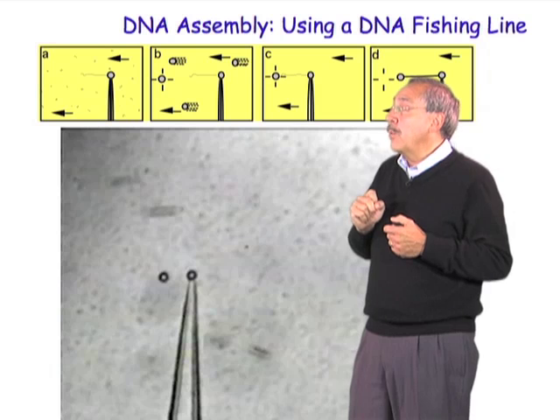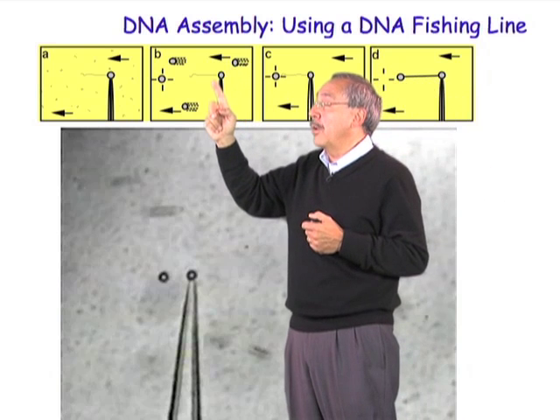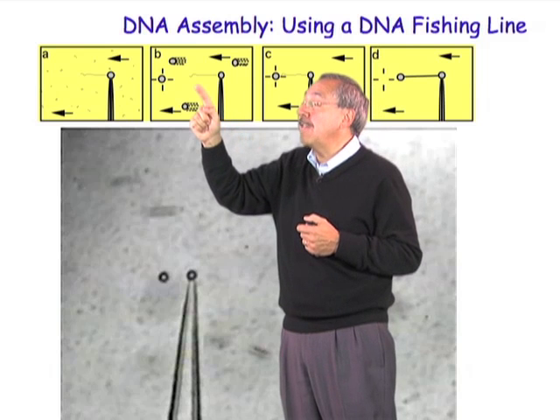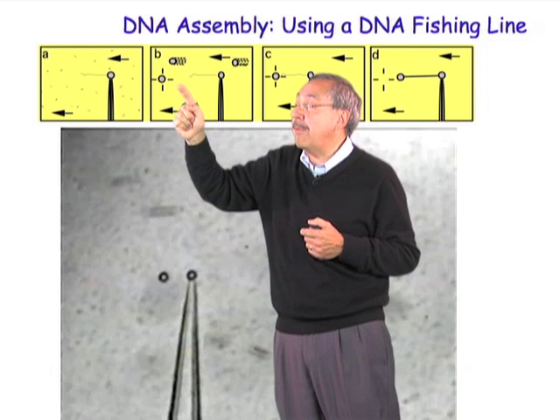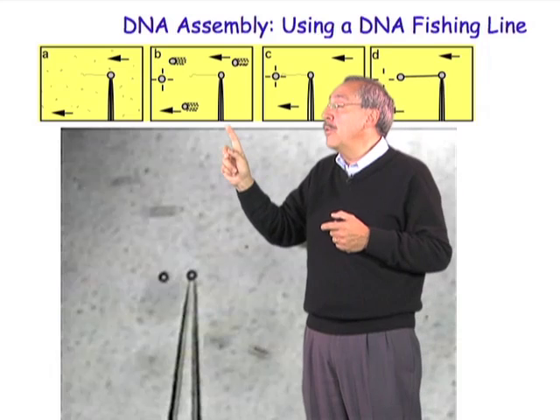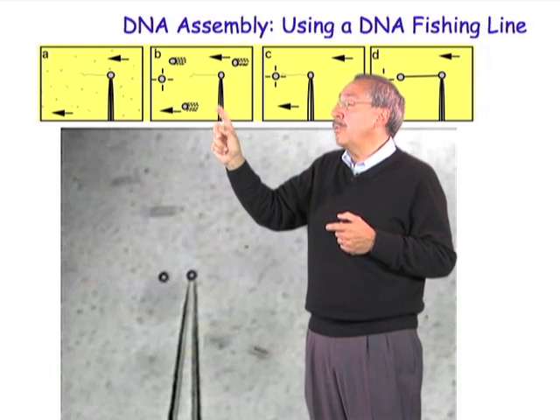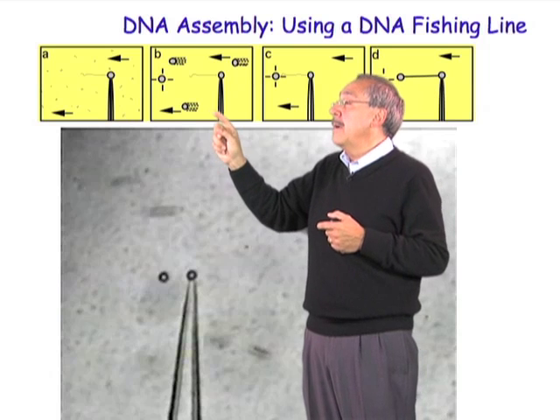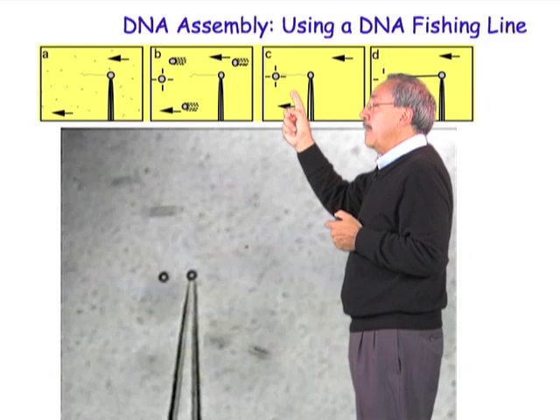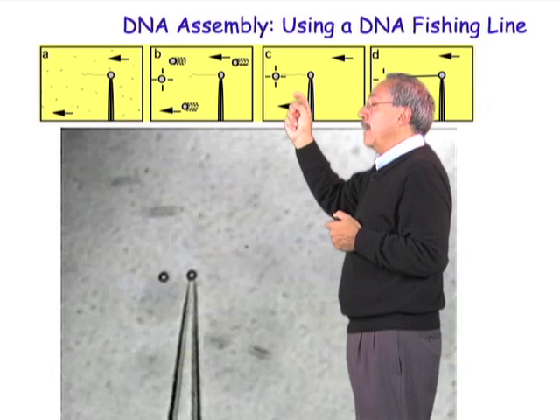Now, still in the presence of the flow, because you want to maintain the molecule of DNA extended, and knowing that that end of the DNA also has a biotin that can react with another streptavidin on the surface of that bead, you approach, by moving the pipette, the bead in the trap to the bead in the pipette, encouraging the formation of a single bond between the biotin at this end of the DNA and the bead.